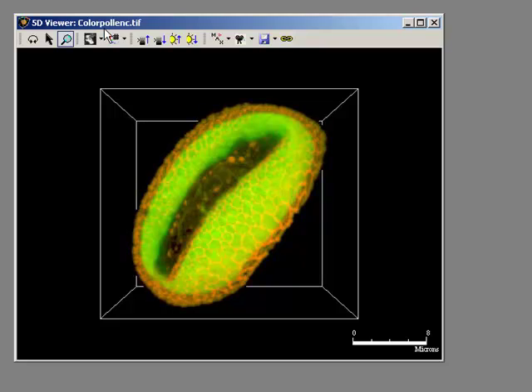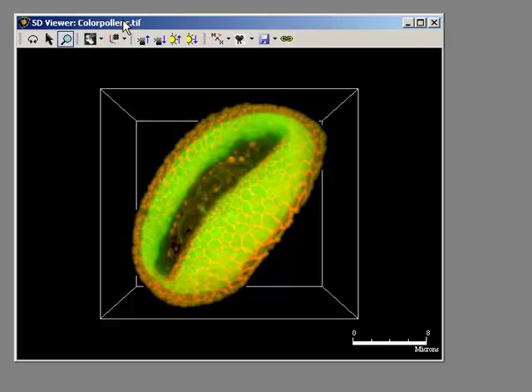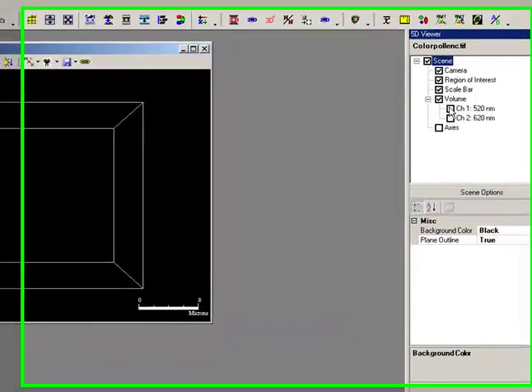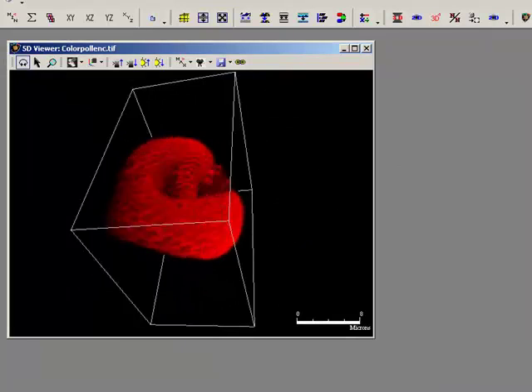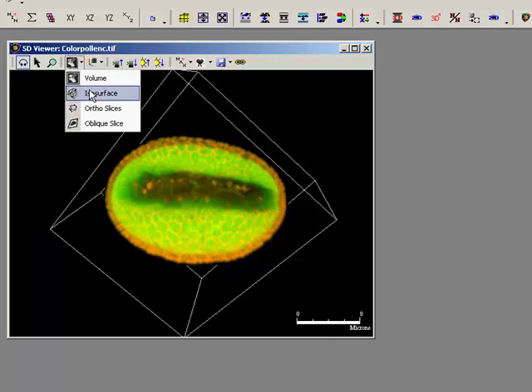The next good thing to show you would be the ISO surface. We're actually viewing it as volume now, so this is a maximum intensity projection, and I can turn the channels on and off over here like this. Come and play around with them. That's all kind of nice. Turn that channel on, but I could also represent it as an ISO surface.